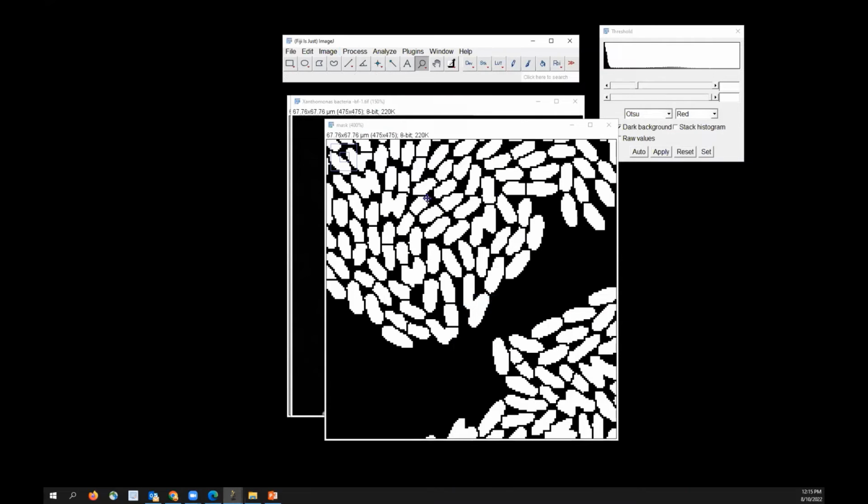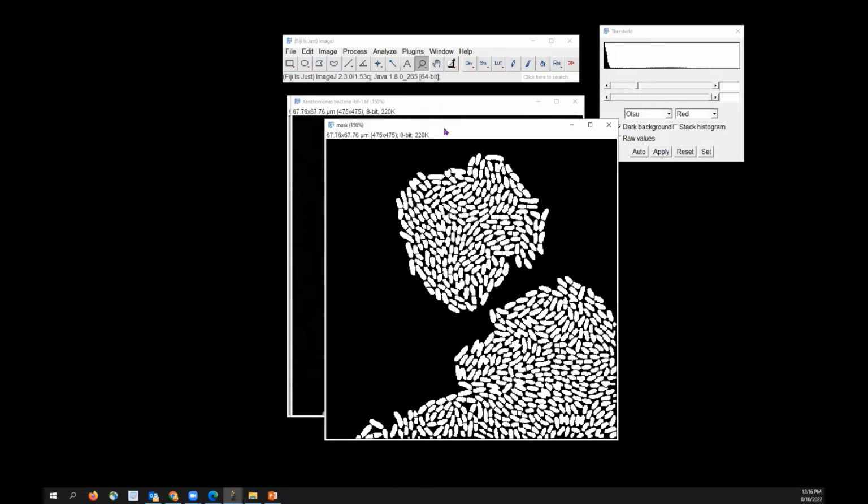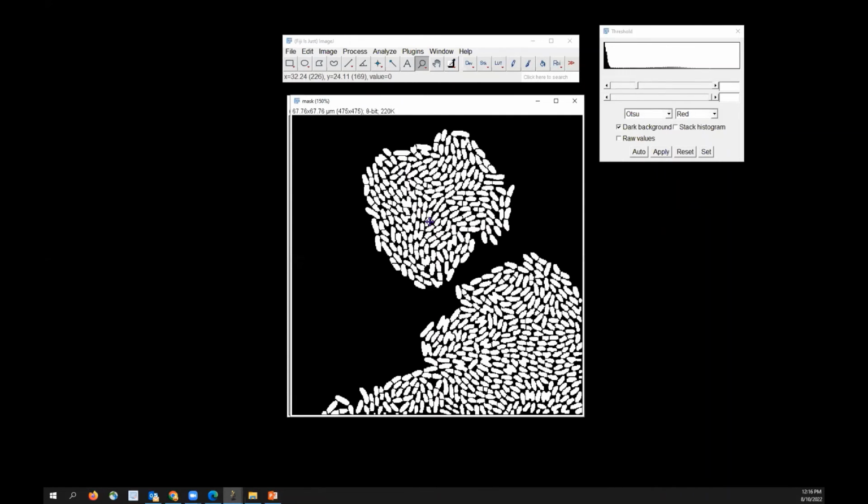And you would immediately see the lines which would separate this out. Now, it's not perfect. The segmentation will always depend on what kind of threshold you choose, okay? So like in this case, for instance, you don't have a division there, okay? But just for demonstration, okay, we'll just use this, okay?